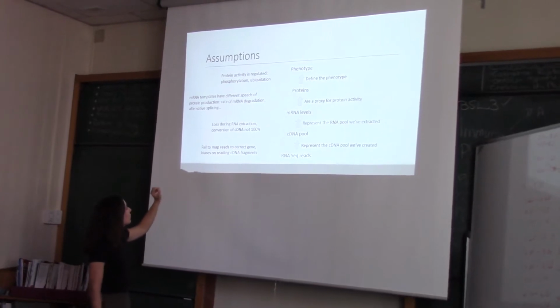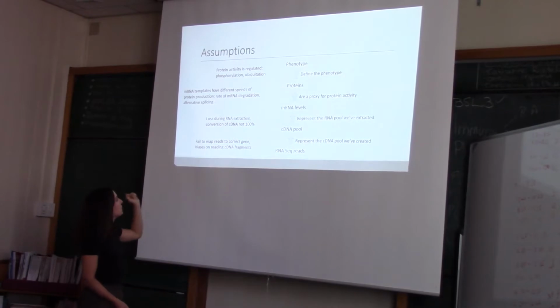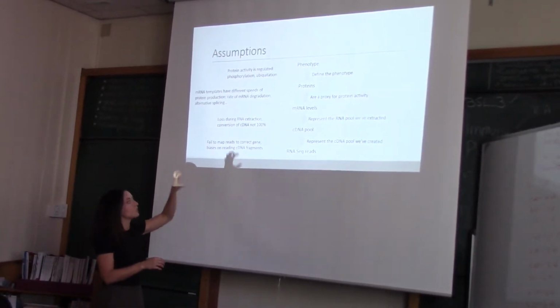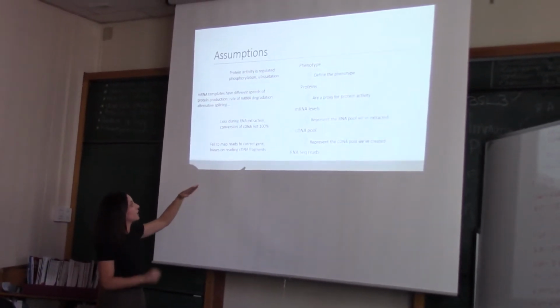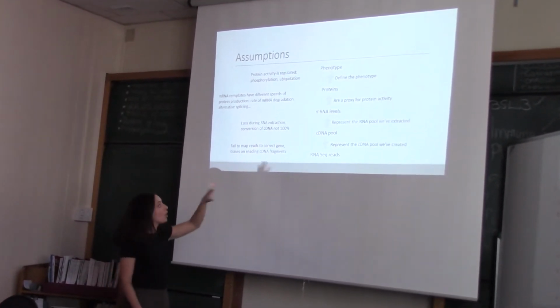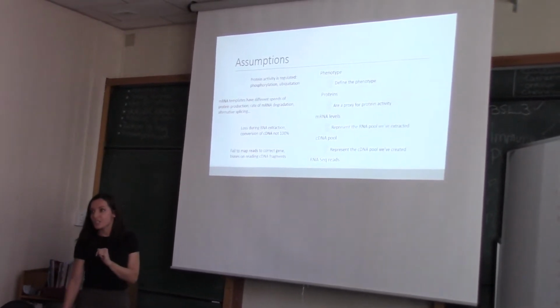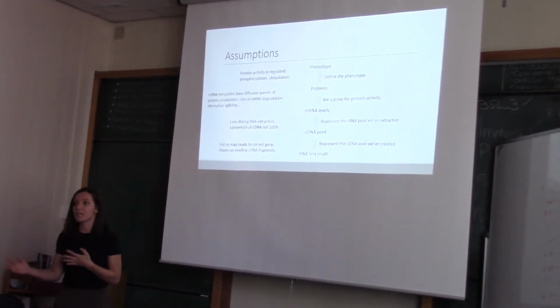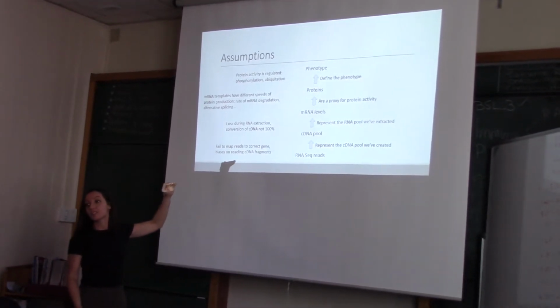The fact is that when you do your RNA-seq, there are a bunch of things that can happen, like failure to map the reads to the correct genes, biases of reading cDNA fragments that will affect the fact that that cDNA pool is not exactly a perfect representation of what we're seeing. From our cDNA pool, we're assuming that the cDNA pool represents the RNA that we've extracted. Another problem here, you can have loss during your extraction. You can have loss because you've done depletion or selection. Your conversion of your cDNA was not 100%, so some things were missed. So another step where we're making incorrect assumptions that could have an effect.